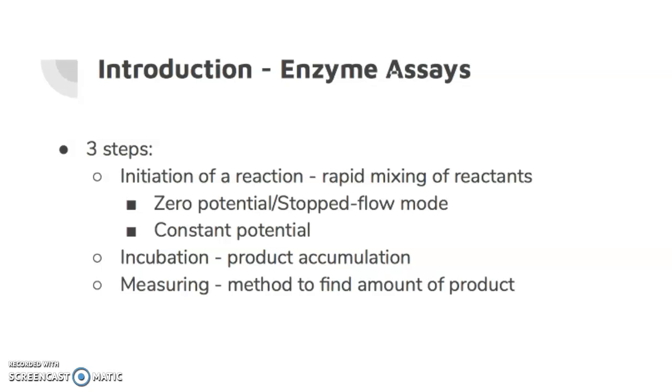Next, I'm going to talk a little bit about enzyme assays and how they're conducted. So there are 3 steps to assay an enzyme. First is the initiation of a reaction where the reactants are rapidly mixed together. Next, there is a period of incubation where the product and the reaction accumulates. And lastly, you want to find a method to be able to measure the amount of product that was formed during the incubation period.